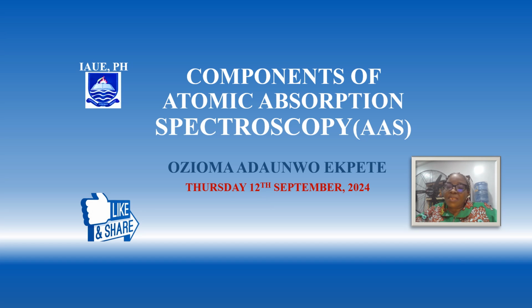In the 19th century, Robert Wilhelm Bunsen and Gustav Robert Kirchhoff, both professors at a university in Germany, discovered spectroscopy, which is a scientific technique used to study the interaction of matter and radiation. Spectroscopy focuses on measuring the absorption, transmission, and emission of radiation by atoms or molecules as a function of frequency or wavelength. It provides information about the energy levels, structures, and properties of molecules.